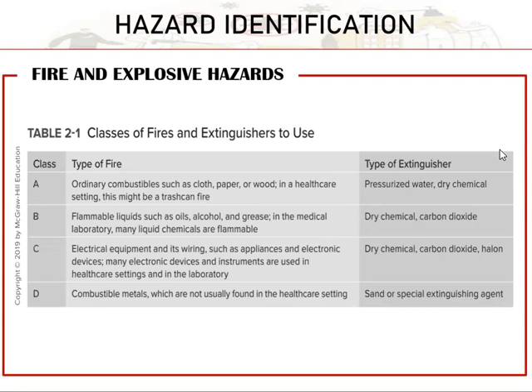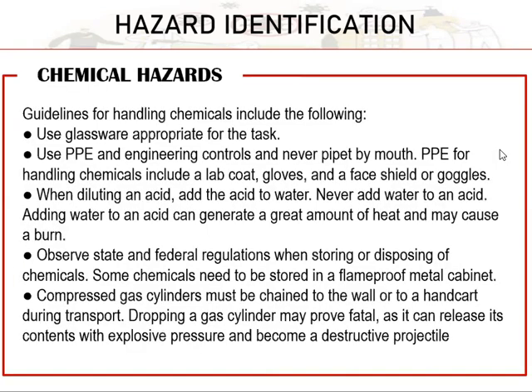So I will not be discussing this one in detail na. I just want you to read this one. Nani siya sa inyong book. What are the types of extinguishers that we will use for the different types of fire. Okay.